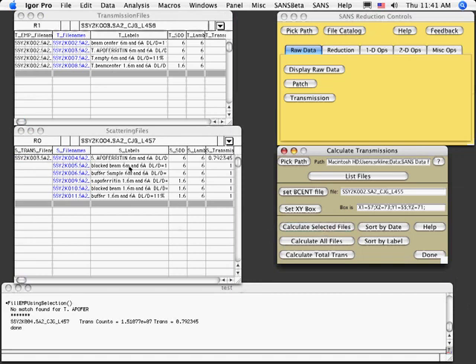This still works, but if you choose a more logical naming scheme, such as naming them all the same, then this guessing procedure will actually work. You can still leave scattering or transmission in the file label, just don't put it at the beginning.